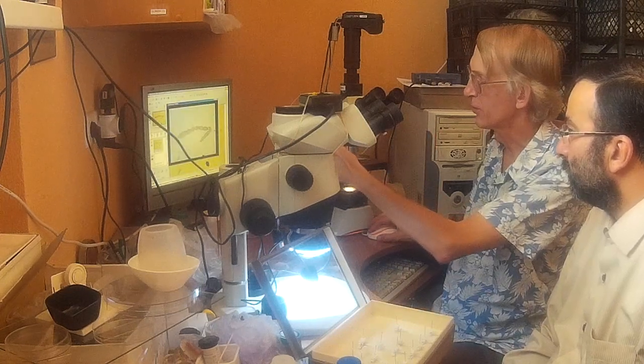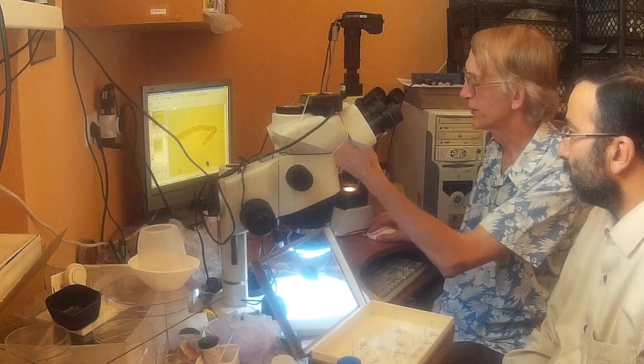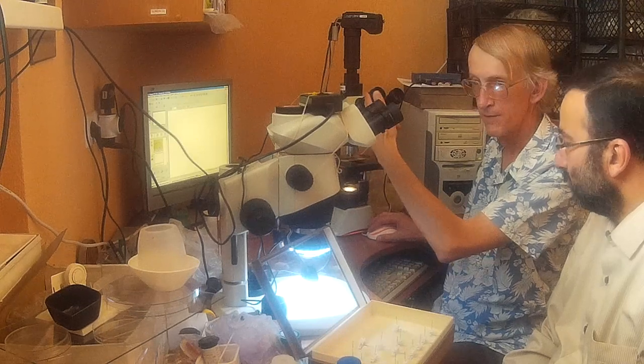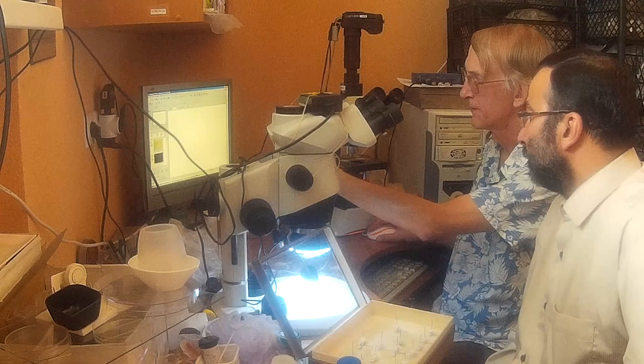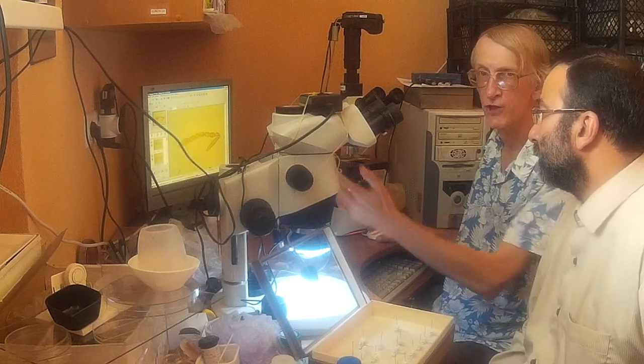We have a special program for that. And when we take a photo, we push this button, it makes a sound and takes a photo. And the photo comes to the computer. This is a photo of an Eurytoma genus.